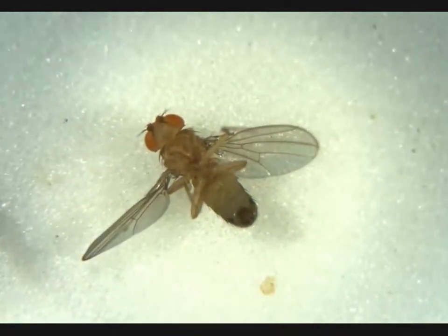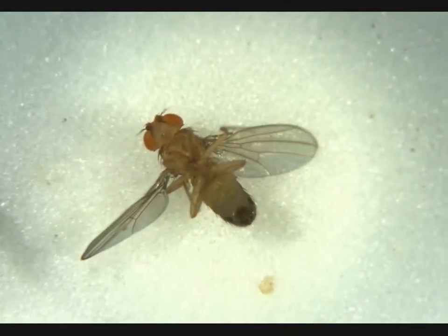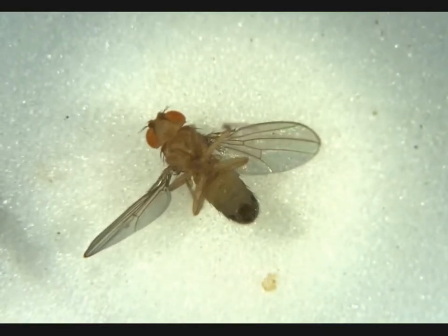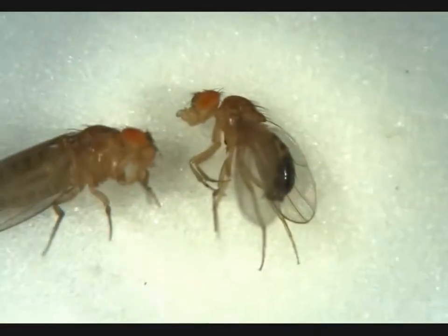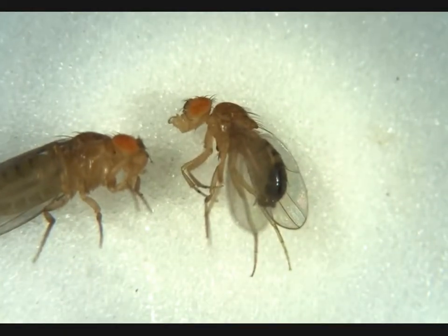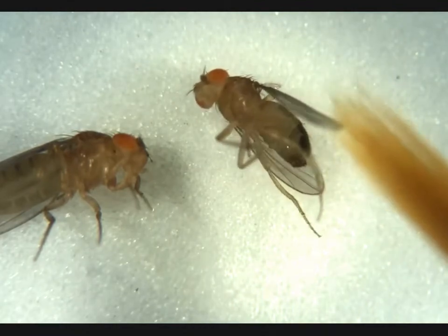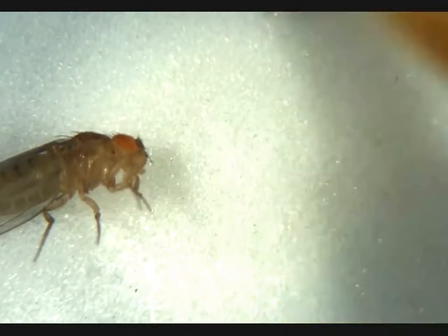Next up, we have another male. Penis apparatus here, no visible meconium — adult male. Now we have another male. We can see the penis apparatus here, and the dark banding on the bottom. No obvious meconium — adult male.